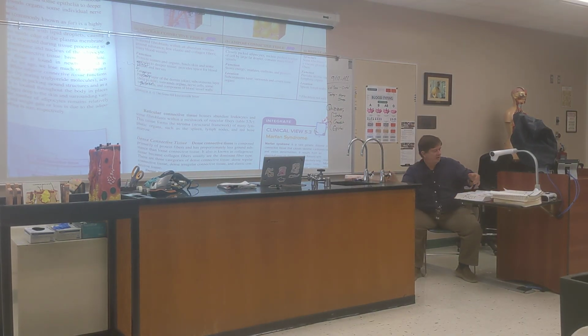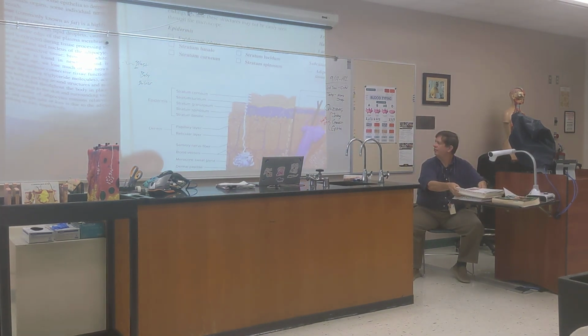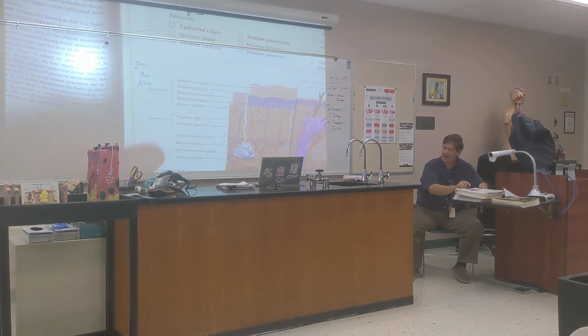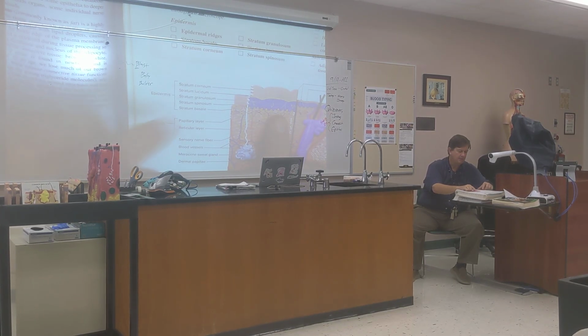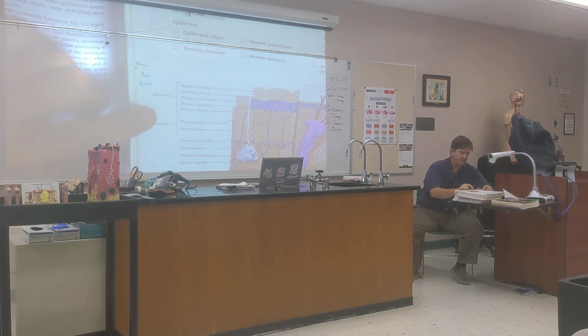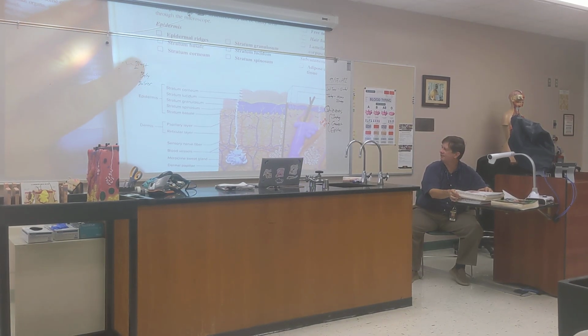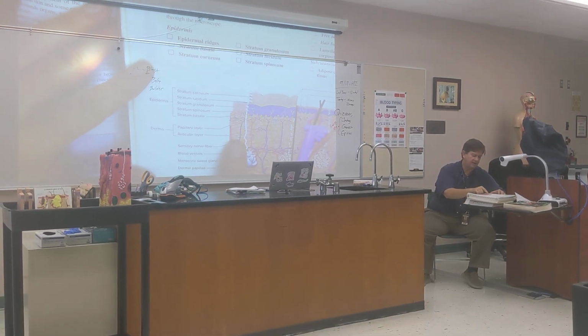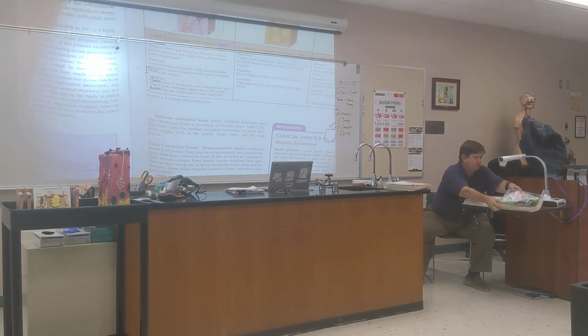Let's pull up your lab book again and show the picture. All right, so you can see the papillary layer is this little tiny part right up here where the dermal papillae are, good? But most of it is the reticular layer down here. That's not making me super happy, so I'm going to go for the other book that has a prettier picture, as it usually does.